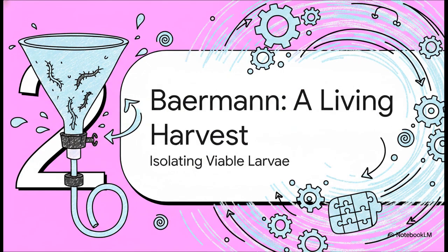So, how in the world do we solve these problems of ambiguity and low sensitivity? Well, this is where the Baermann technique makes its entrance. And you have to understand, it's not just another concentration method. It's this really elegant solution designed for one specific purpose: to harvest living, motile larvae. And that is exactly what we need.